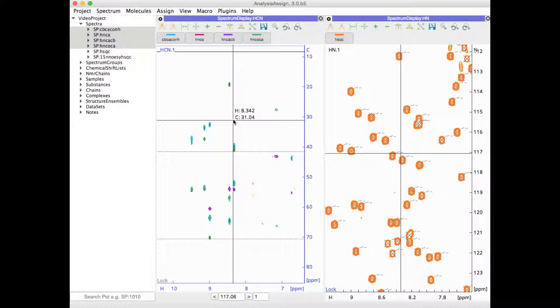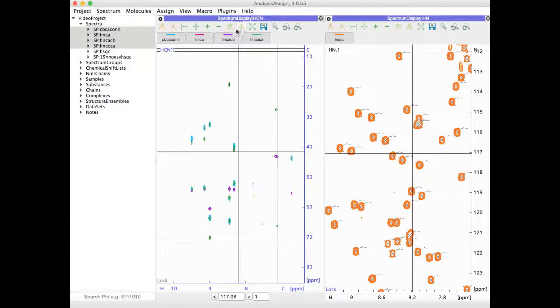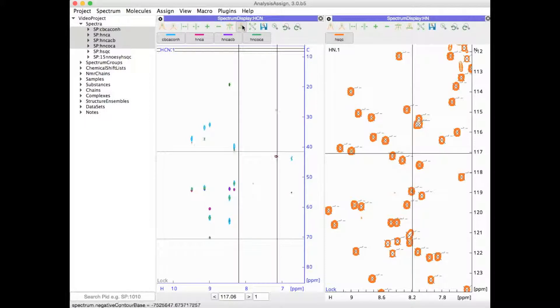You can change contour levels simply by going to the buttons in the toolbar and either raising your contour level or lowering it.